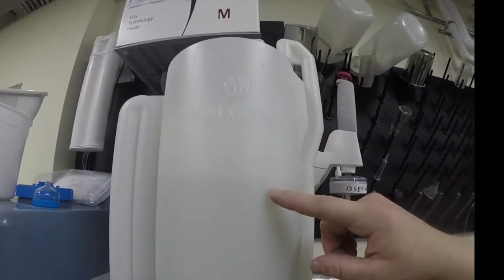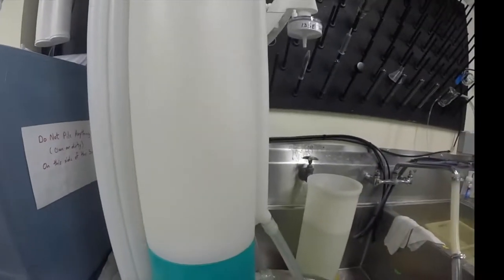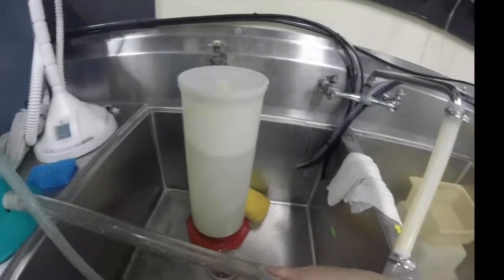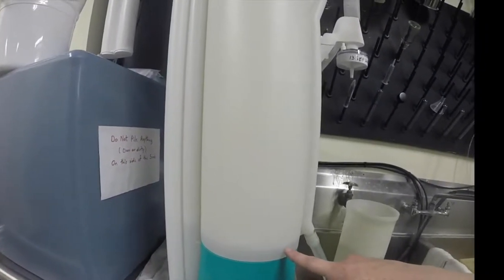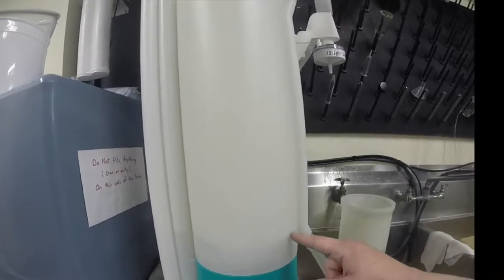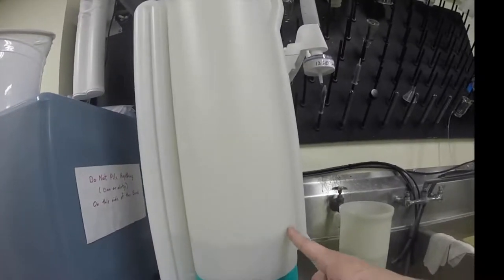This guy right here. The flow rate I had it at was a little bit too low, but as you can see, it's draining pretty quickly now. I'd use a slightly higher flow rate for filling it. But yeah, it's draining really quickly right out here. Okay. But you can see that it's now going to start filling up again. So it stopped coming out of here, and now it's going to slowly start filling up again.